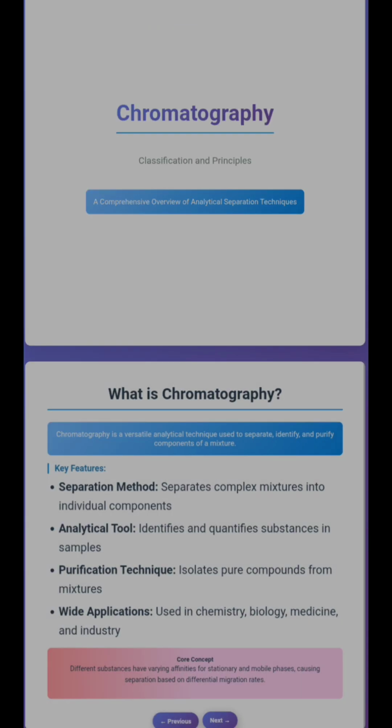What is chromatography? Chromatography is an analytical technique used to separate, identify and purify components of a mixture. The key features of chromatography: separation method, analytical tool, purification technique, and wide applications.